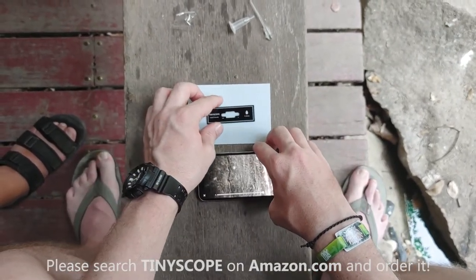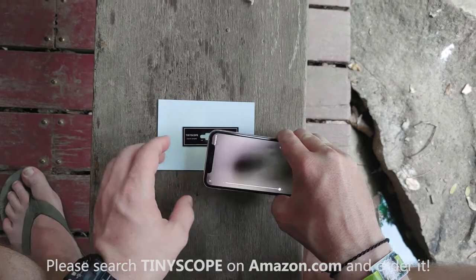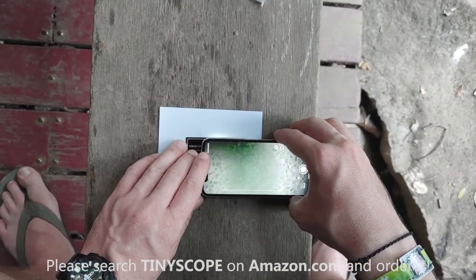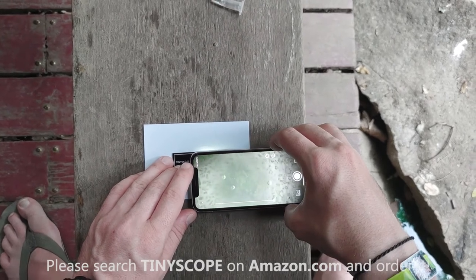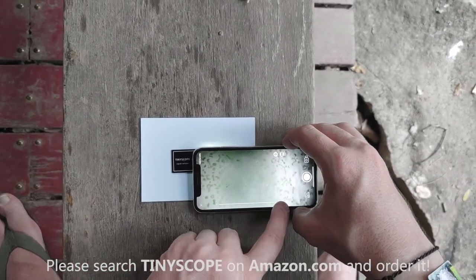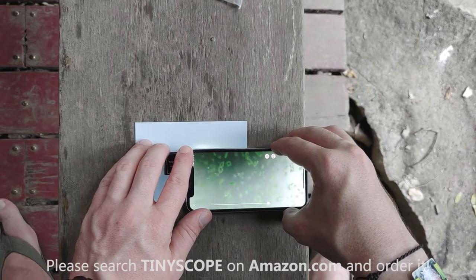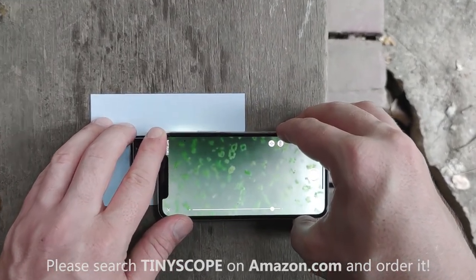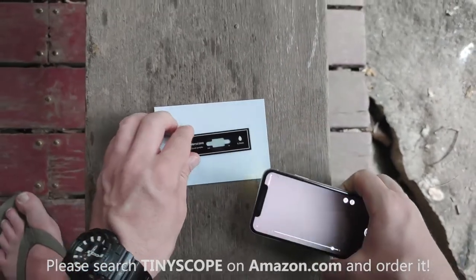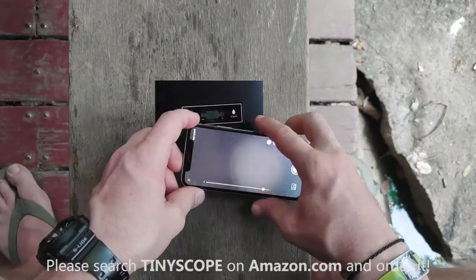Let's see what we can see. Grab your Tiny Scope and slowly bring it down onto your sample. We can see that green in the water — all those little green floating plants, pond things as we like to call them. We're using the white background right now and it's not bad — actually that's a pretty good shot! We can see pretty well with this one. Let's switch over to the black side and see if that helps.